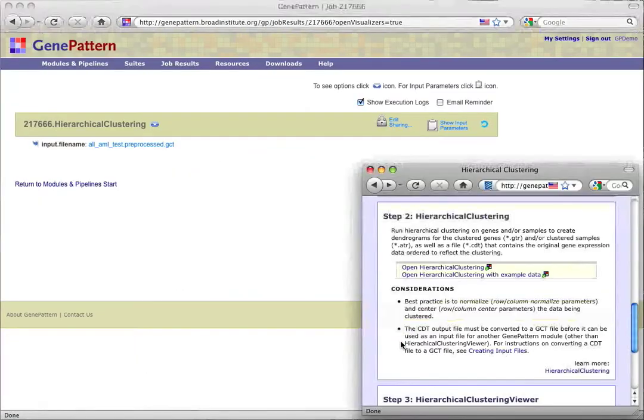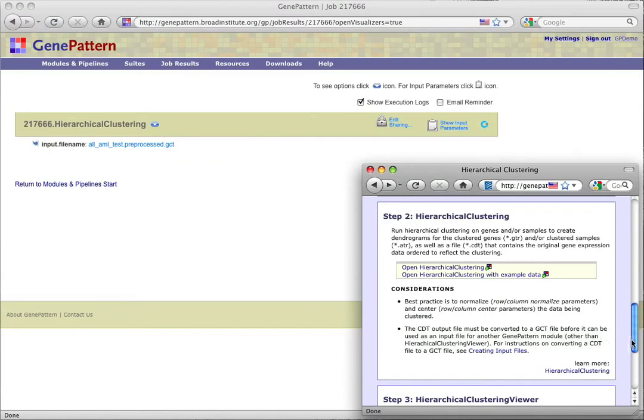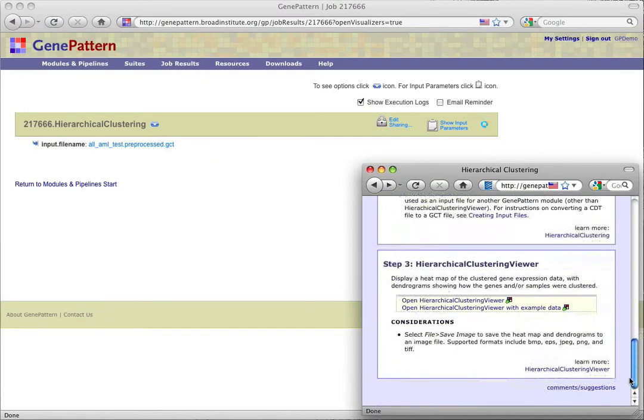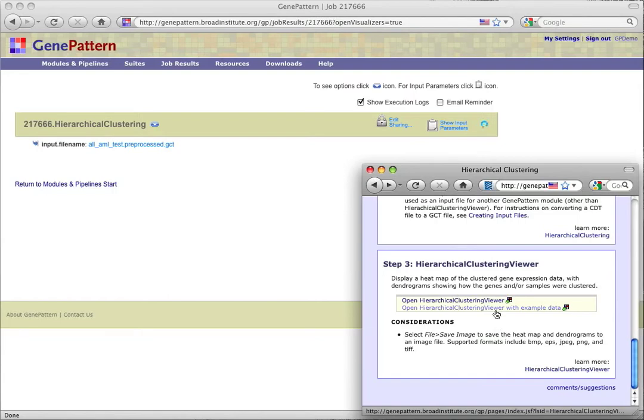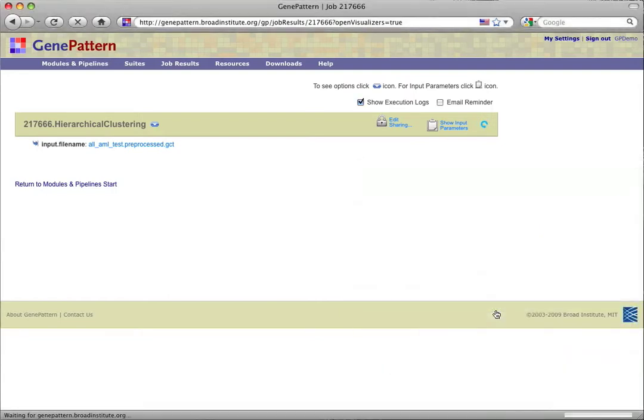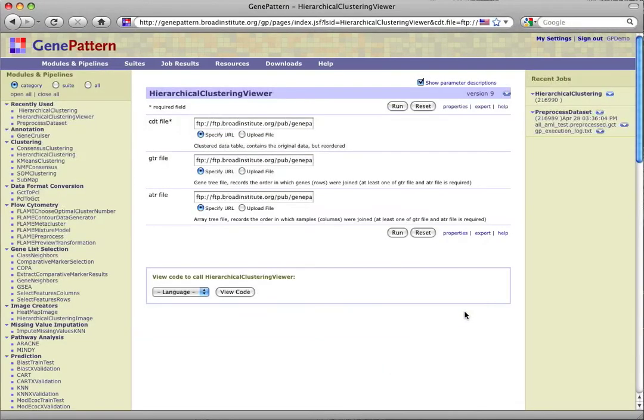While that runs, we'll examine step 3, the final step of this protocol, which happens to be a visualizer. Rather than wait for the example data to finish running through hierarchical clustering, if it still is, we'll choose to open the viewer with example data. There are no parameters to change here, so we can just go ahead and run the visualizer.